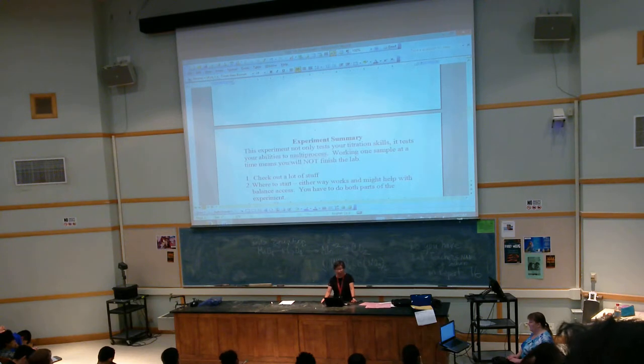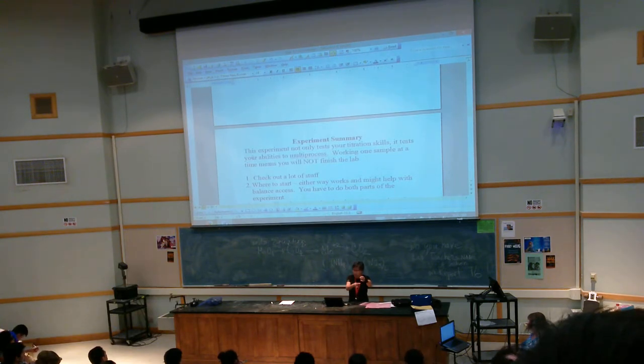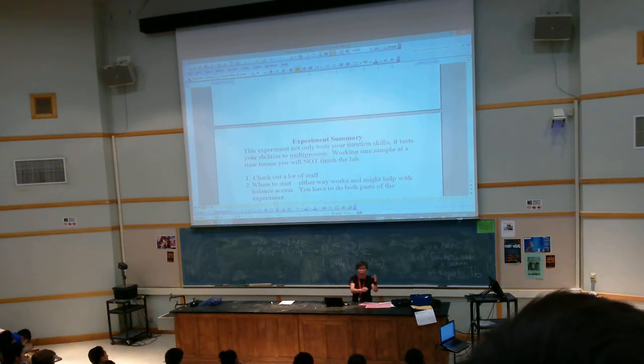The experiment summary. This experiment not only tests your titration skills, it tests your abilities to multi-process. So, what do we mean? You're going to do the cooking with your unknown sample with aluminum. I'll show you what the setup looks like. When you're done with one, you can start cooking the other. Otherwise, you won't have enough time because there's cooling time, etc.